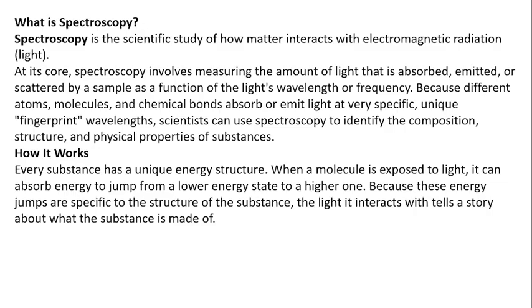Hello everyone. In this video, we are going to study UV visible spectroscopy. So let's get started. Very first, what do you mean by spectroscopy? Spectroscopy is the scientific study of interaction between matter and electromagnetic radiation, which means light.